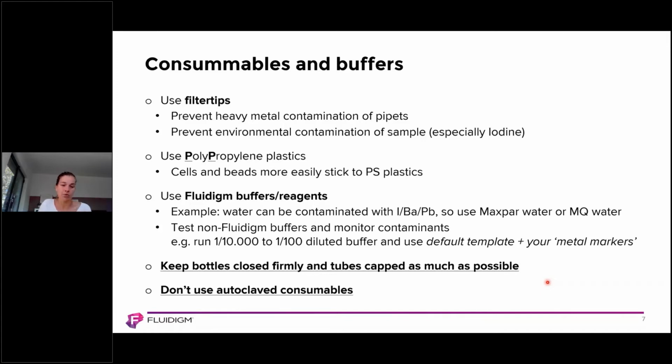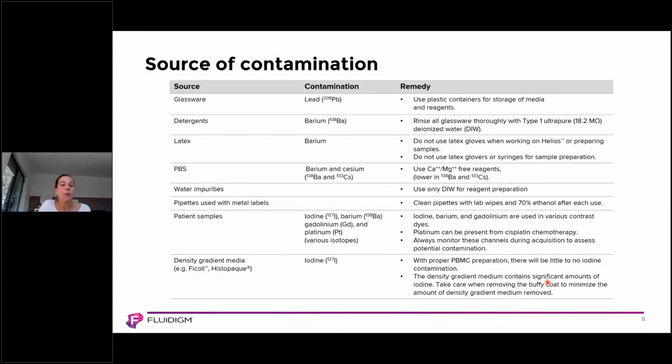It's better to just forget autoclaved consumables. Now we will see really quickly some possible contaminants. The first one is lead. Lead is present in glassware.